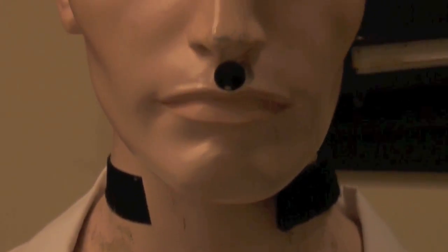Manny might sound like some sort of outcast worker bee, but he's actually a valuable member of LabConco's engineering team. He's our ASHRAE test mannequin.